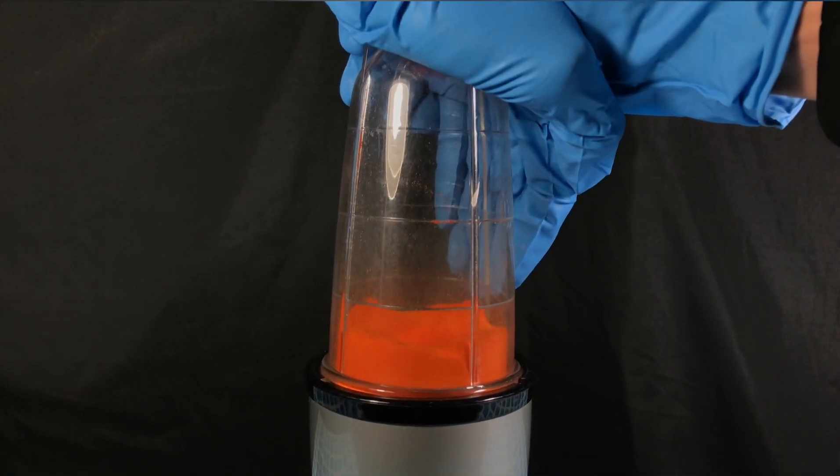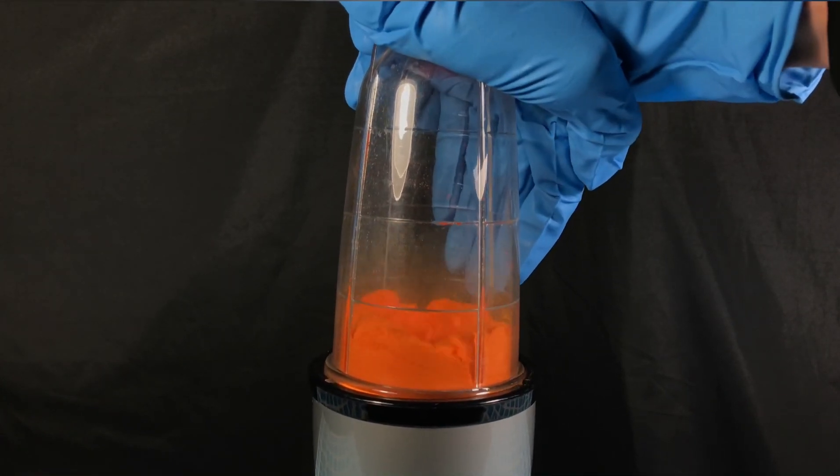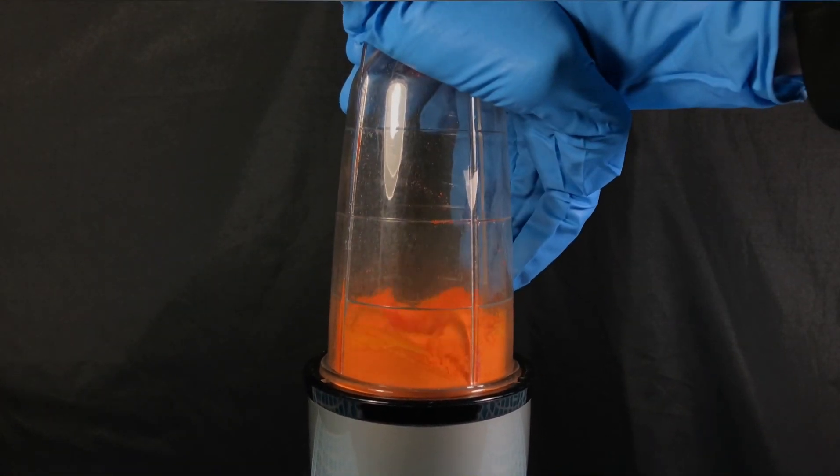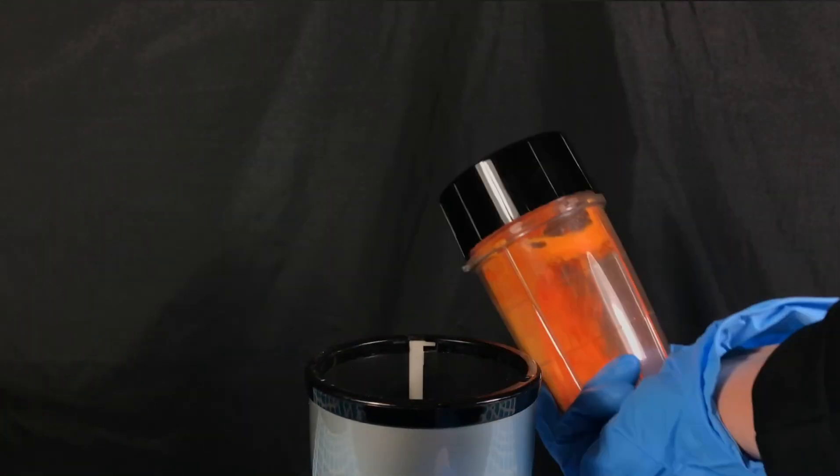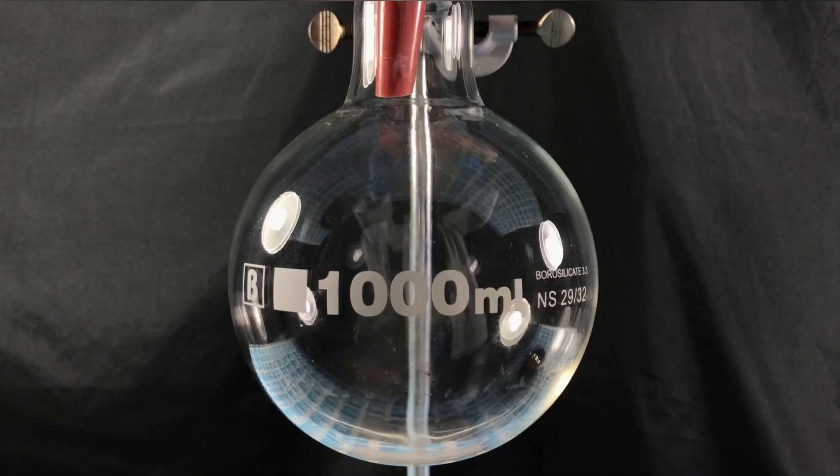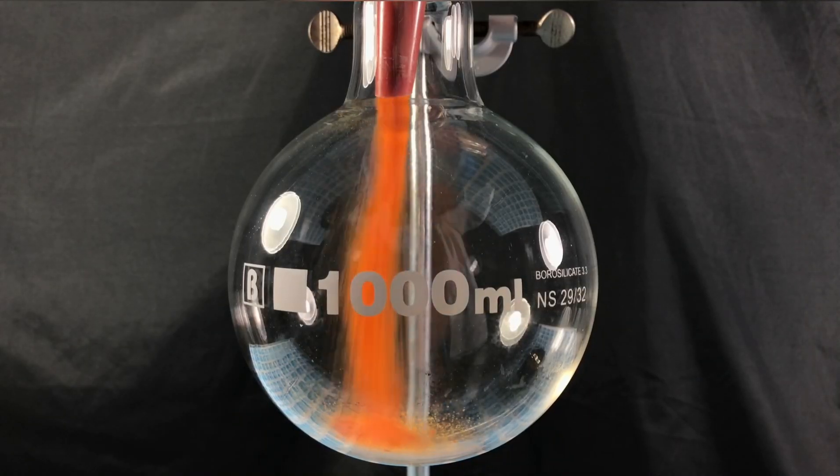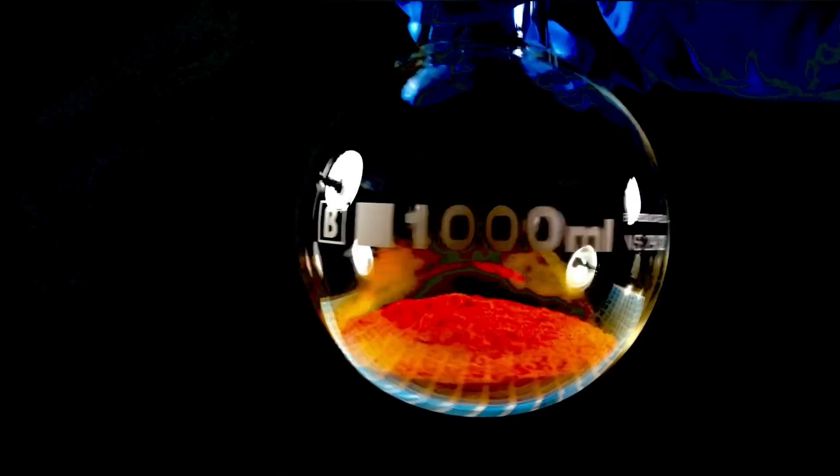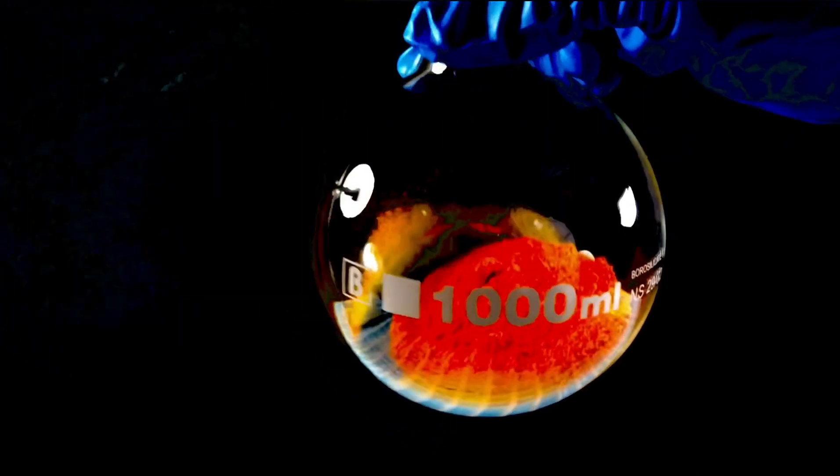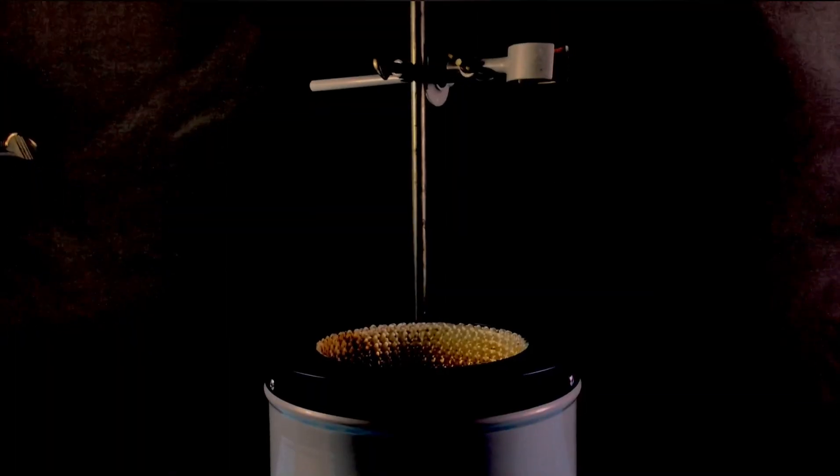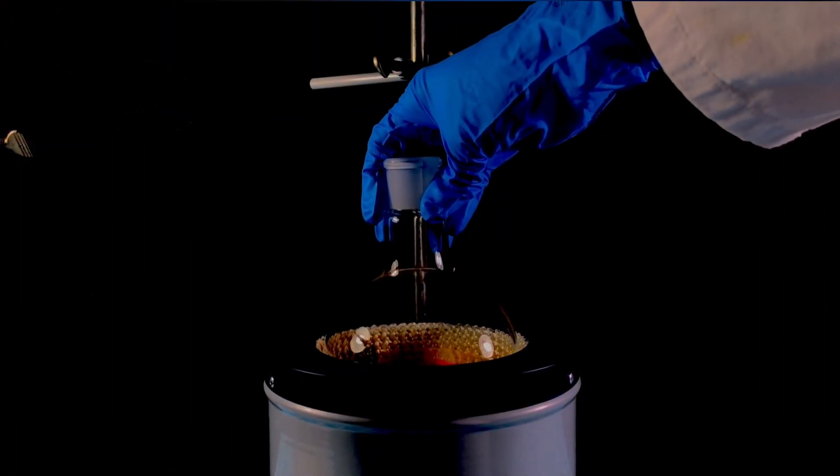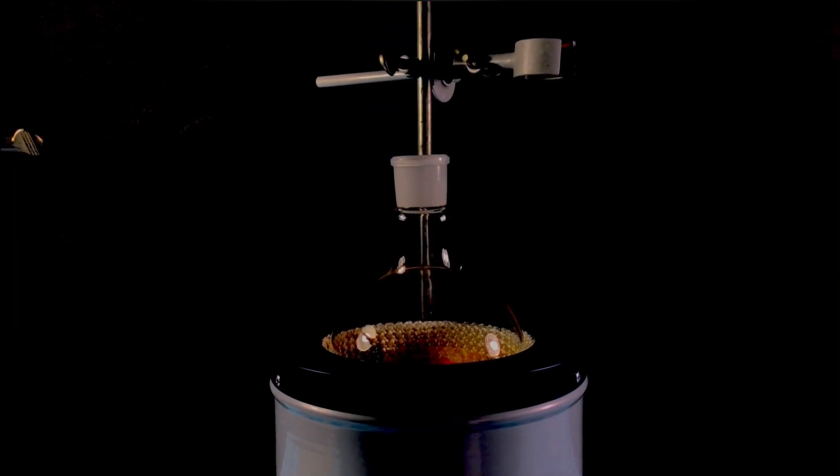When this mixer is opened, a lot of dust will escape. A gas mask was worn while transferring the mixed powders to a 1 liter round bottom flask. We took this flask and put it into heating mantle. No stir fish was used. The large amount of powder would have prevented the stir fish from working.